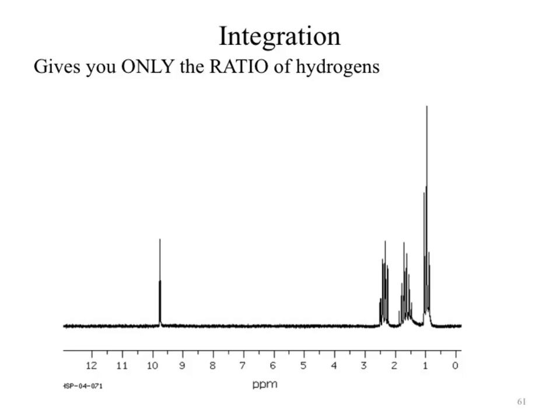However, if we take a look at our HNMR, is it just peak height? What else is happening? Okay, we can get the number of peaks within our signal, which then means our signal starts to broaden. As it broadens, what happens to the area underneath the curve? It increases. What does that necessarily do to the peak height? It brings it down. So when we're looking at the integration, it is the area underneath the curve which is determined by two factors, peak height and peak width.